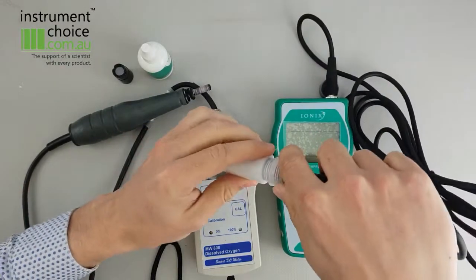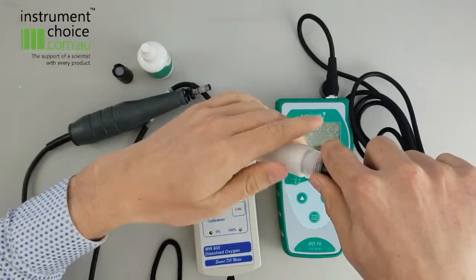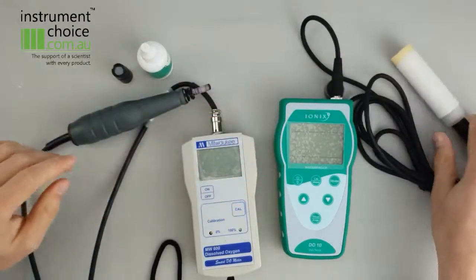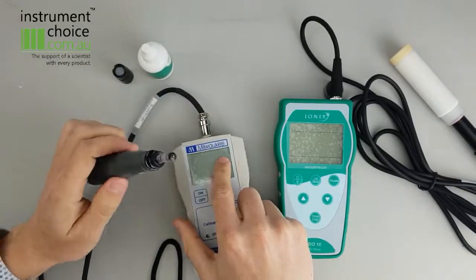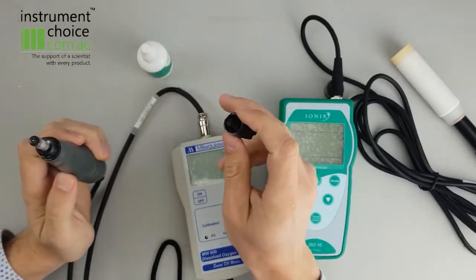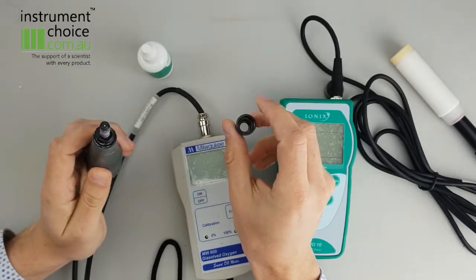So in general, with a meter such as this, you only need to replace the sensor cap on a yearly basis and calibration is much simpler. On an instrument such as this, you need to replace your membrane and your electrolyte filling solution, and calibration is a little bit more complex.